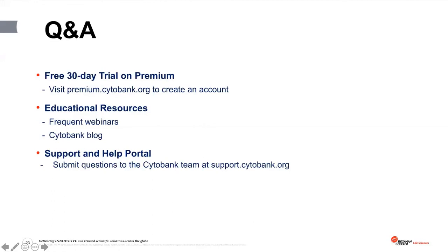Okay. A really good question as well. Can we transfer metabolomic or microbiomic data into Cytobank? Jihao, did you want to tackle this one again?